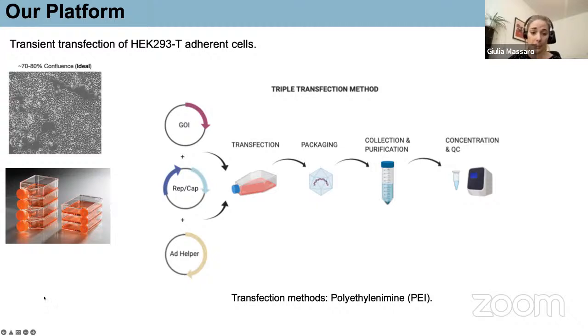At the moment, we are using PEI Max as transfecting agent, but I am testing different products on the market to check if different products have different effects on the yield and quality of the vectors.